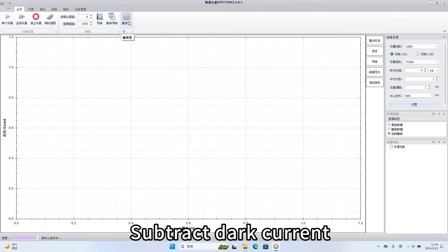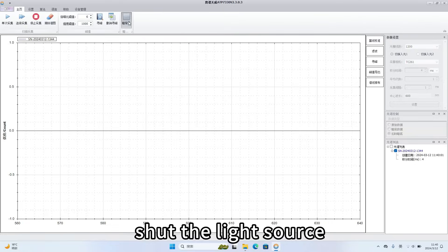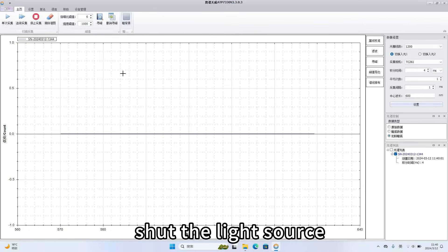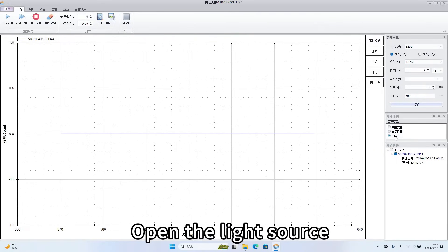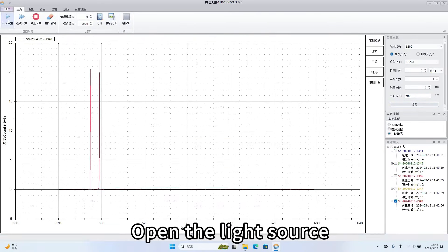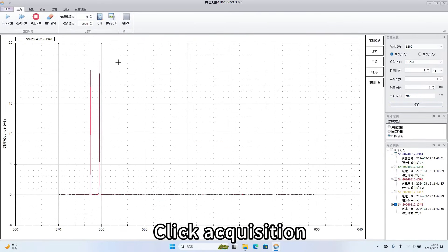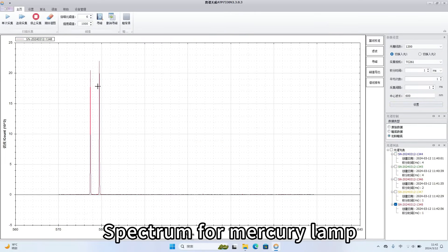Subtract dark current. Shut the light source. Click on the dark. Open the light source. Click acquisition. Spectrum for Mercury lamp.